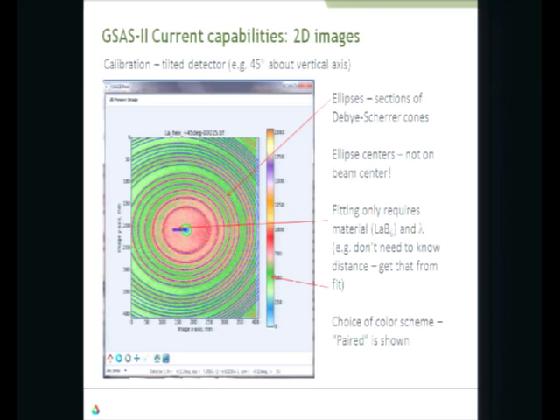And one of those things that involve the right answer has to do with this little set of crosses, which marks the center of each of the ellipses, which is not at the same position. That's a sort of mathematical thing.